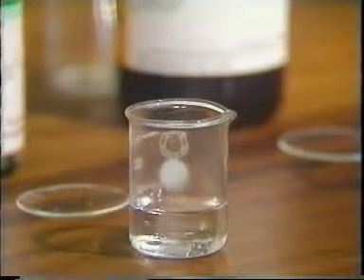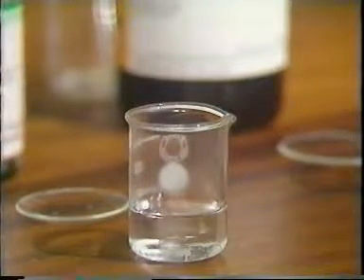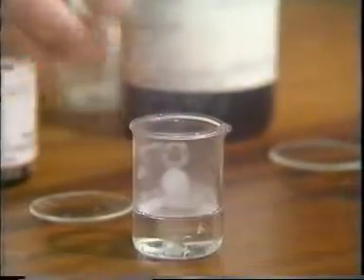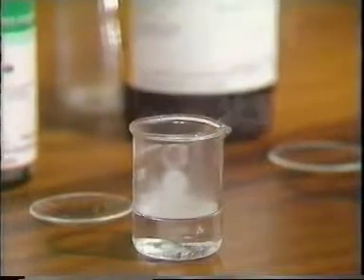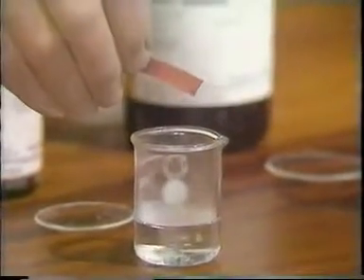I'll see whether there's enough fumes given off to test. Yes, not much doubt about that, but I'll use some blue litmus as well. And there again you can see it rapidly turning red.